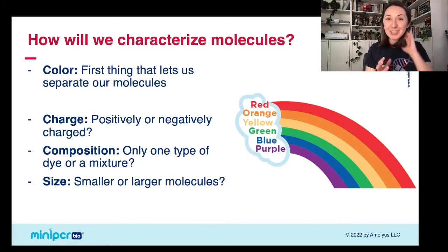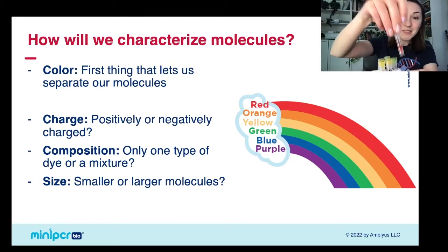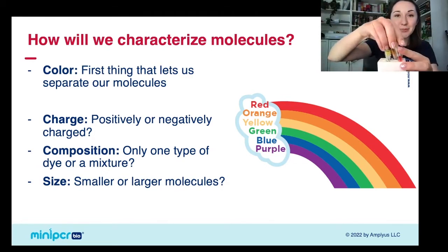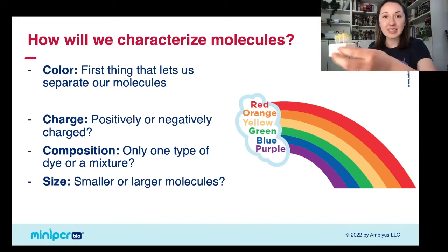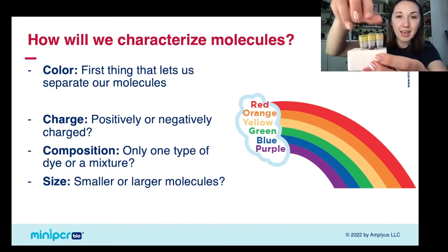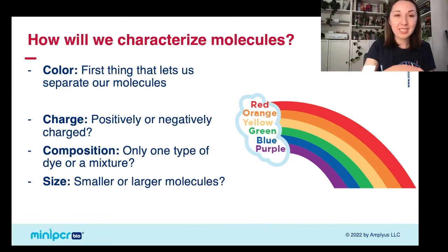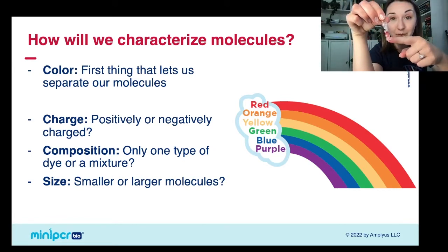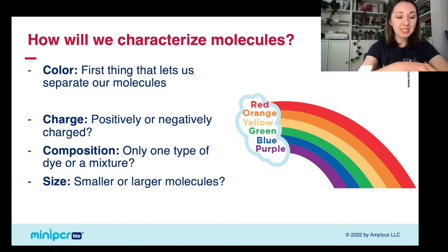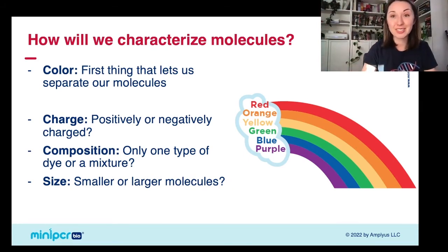So what we're going to do today is characterize some molecules that we have in these tubes here. So I have six tubes, and they each have a different dye in them. And the first characteristic that you're going to be able to really clearly separate these dye molecules on is their color. That is a really obvious characteristic: these six molecules in these tubes all have one really distinct different characteristic. They're all different colors. But through this lab, we're also going to be able to characterize the charge of each of these dyes, the composition of these dyes. So are they made up of just one type of molecule or multiple types of molecules? And we're going to be able to say something about which of these dyes is smaller or larger than the other. And we're going to do all of this using gel electrophoresis.